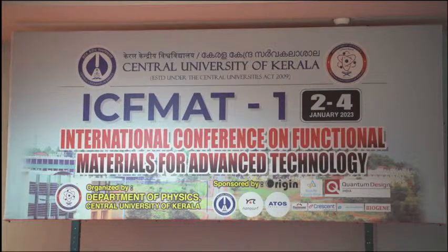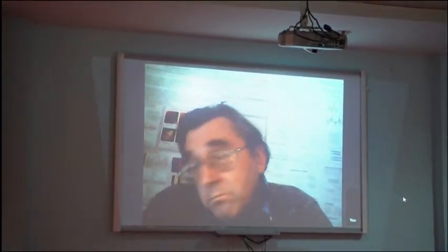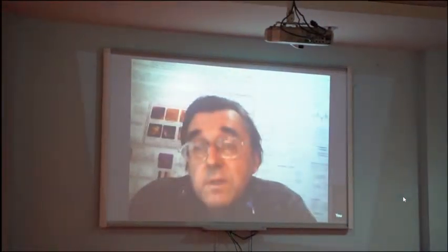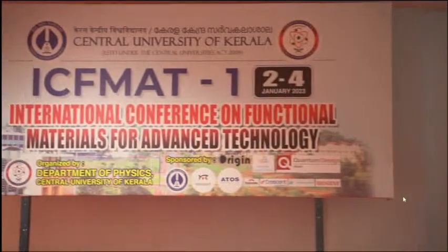This is important. It depends on the situation and on your signal. In all IFM and PFM, morphology effects are not possible to remove absolutely. I hope I answered. Yes or no?